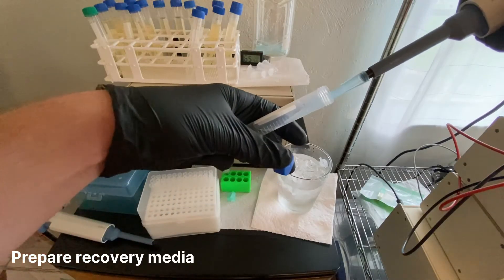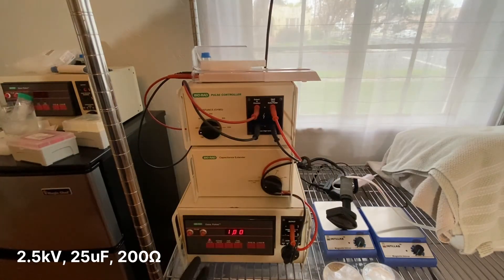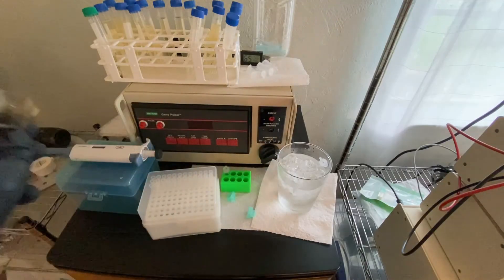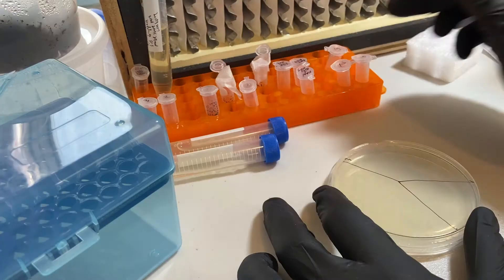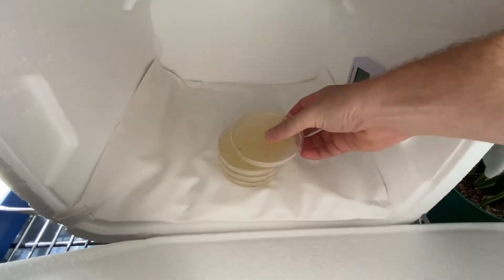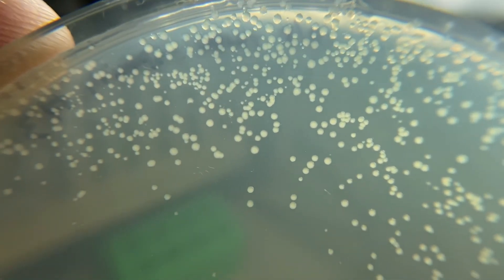Drop 1.2 mL of fresh LB broth into a pipetter for quick cell recovery. Add the 40–60 µL DNA-cell suspension to the bottom of a 2 mm cuvette and tap to distribute evenly. Place the cuvette into the electroporator and configure it to 2.5 kV, 25 µF, and 200 Ω resistance. Electroporate, then quickly pipette the recovery broth into the cuvette and gently resuspend the cells. Transfer cells with recovery broth to a tube and incubate for 1–2 hours, turning tubes over every half hour with the lid open for air exchange. Plate 150 µL of the recovered cell suspension on warm antibiotic selection plates, incubate upside down overnight, and confirm transformed colonies the following morning.